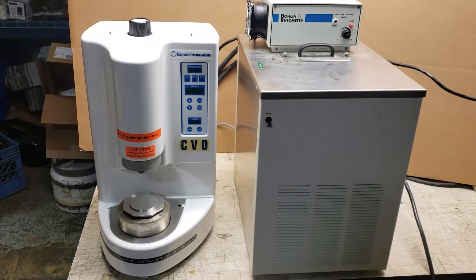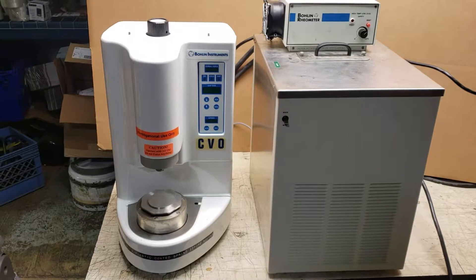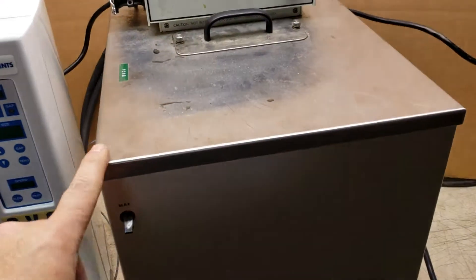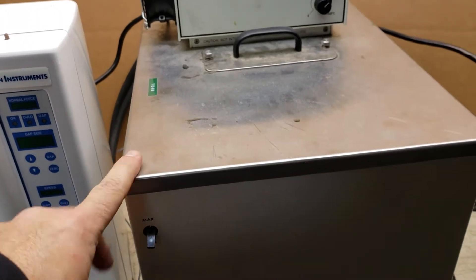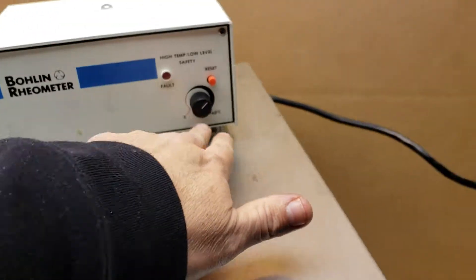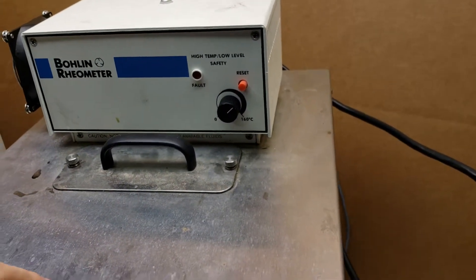This is a Bolin Instruments rheometer. This is actually a Nestleb water circulator with a 0 to 160 degrees Celsius temperature range.